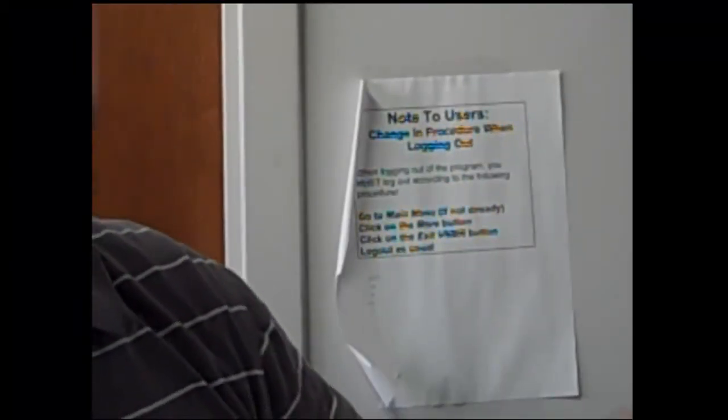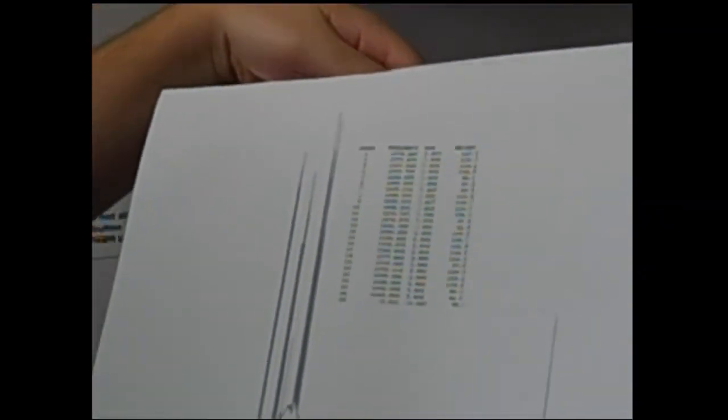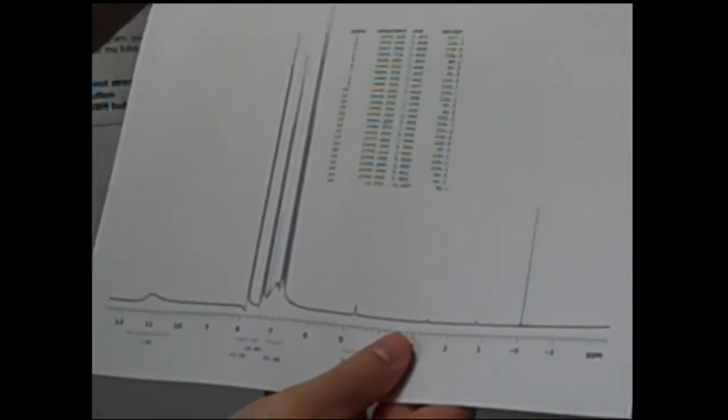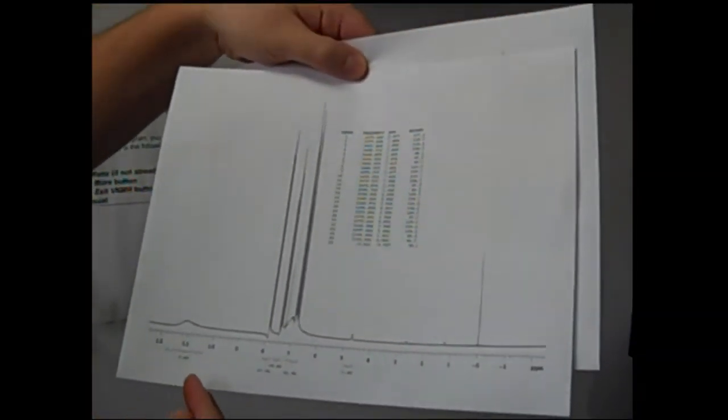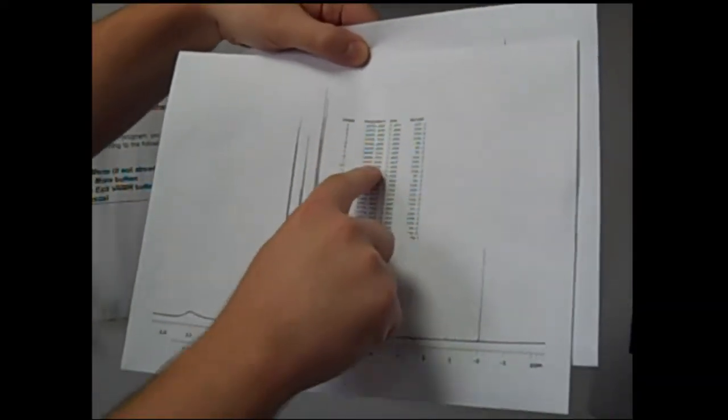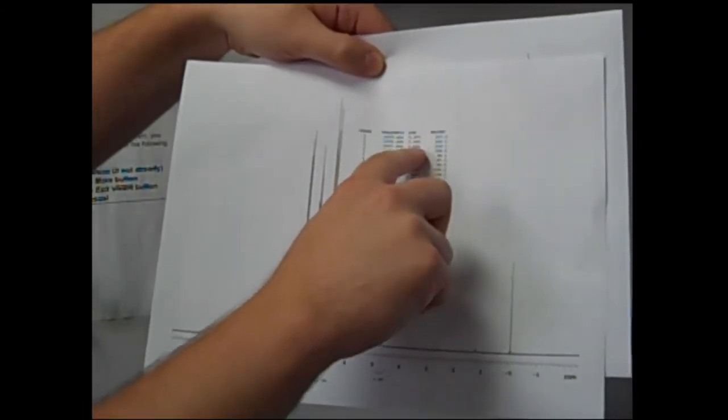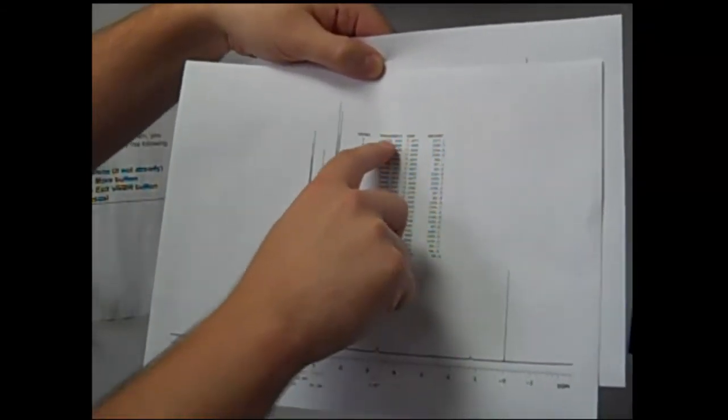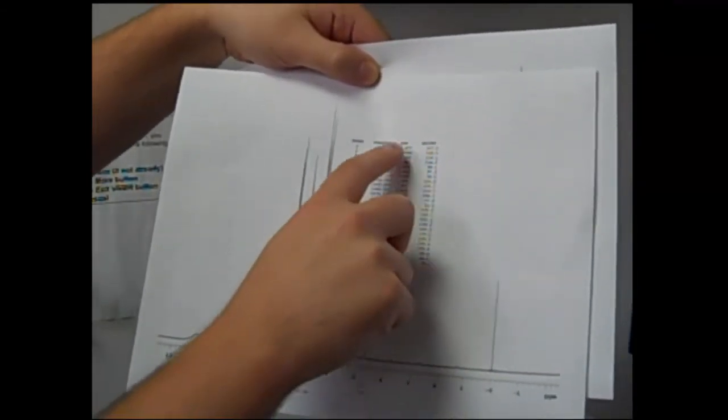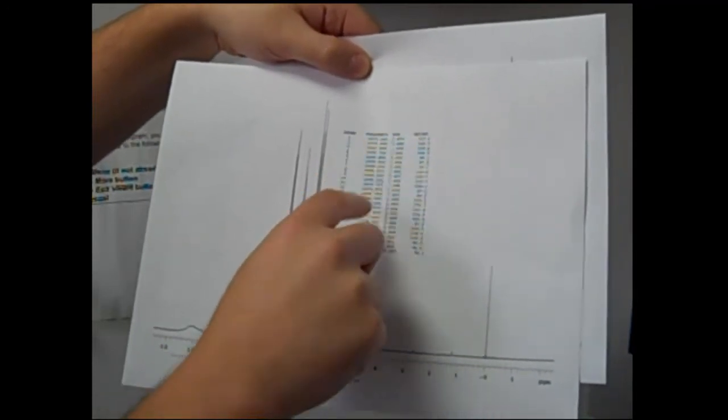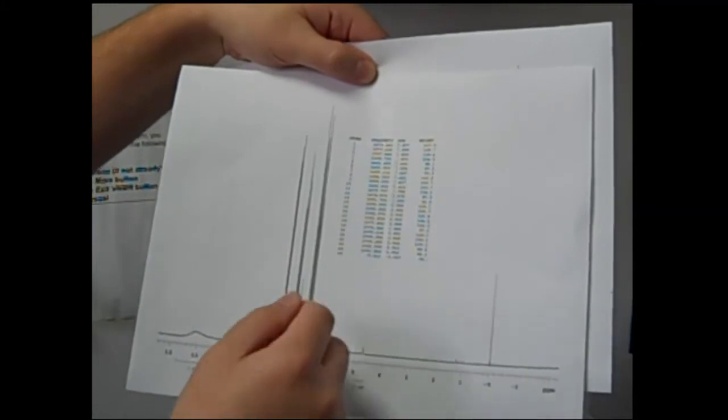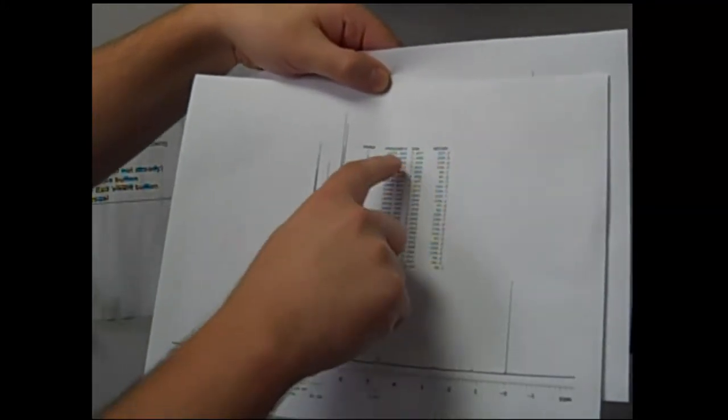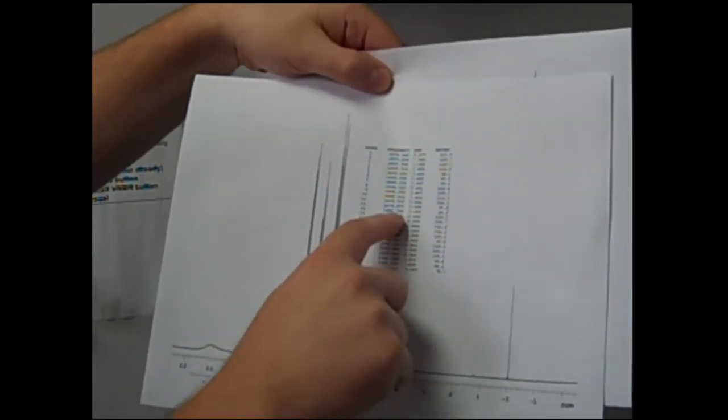Once you've completed, you'll be able to hand students printed NMRs, a complete zoom out of the entire spectrum, usually 0 to 12. All the peak data is here. Notice the part per million values and the frequency values. The only difference is that the part per million values are multiplied times 200. 200 megahertz is the operating instrument of the machine to get the frequency values.